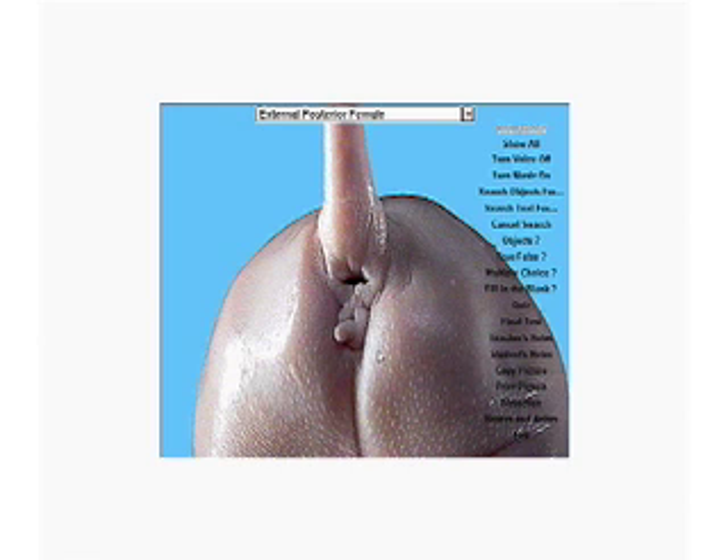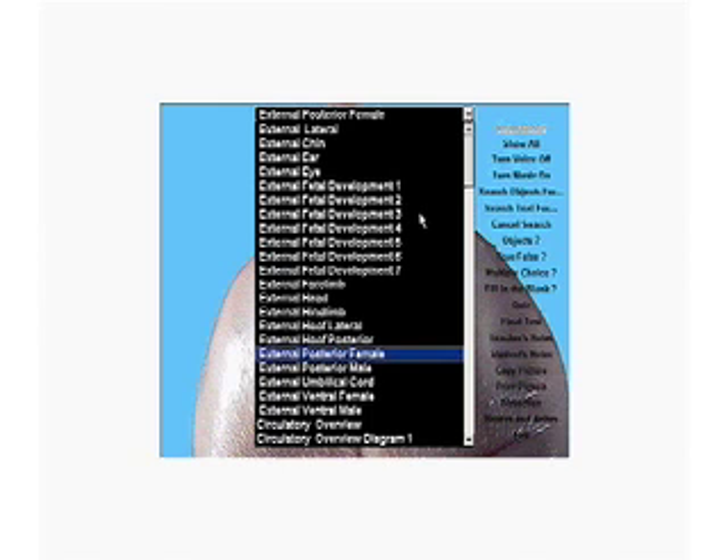Here's a butt shot of a little girl piglet from behind. Anus — that's obvious — but the female pig has a second opening below the anus: Urogenital Sinus. And below that is a little tag of tissue called Genital Papilla. We'll come back and see that again in a moment.